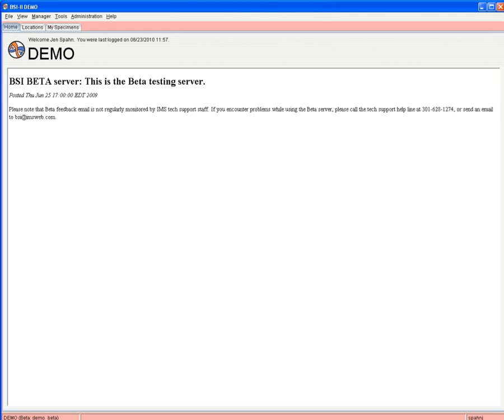Again, we will cover the My Specimens interface and changes to locations as well as the right mouse button menu. Participants are muted, and I will address questions at the end after the demonstration. These changes are made for users in our small labs, but may be helpful for everyone. The intent was that users for most tasks wouldn't have to work outside of the EZ interface, the locations in My Specimens tabs.